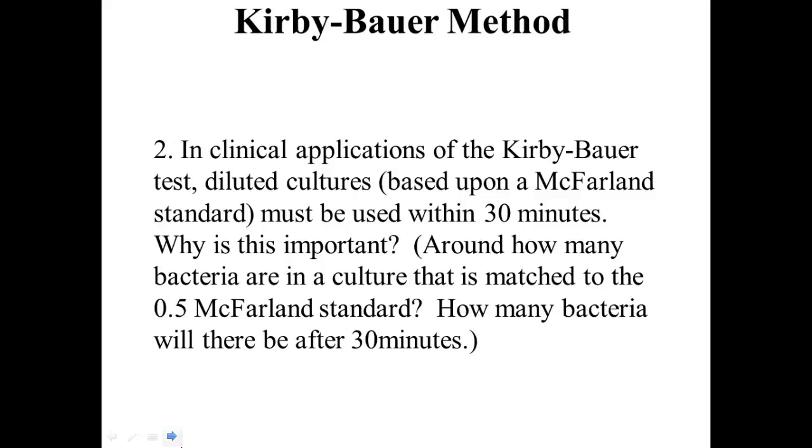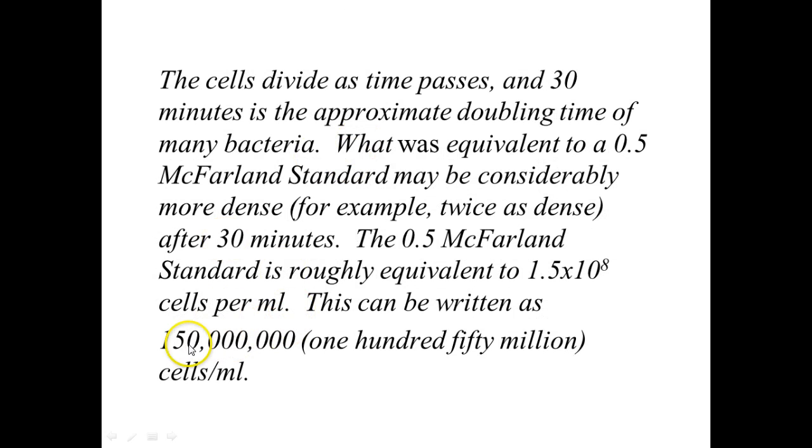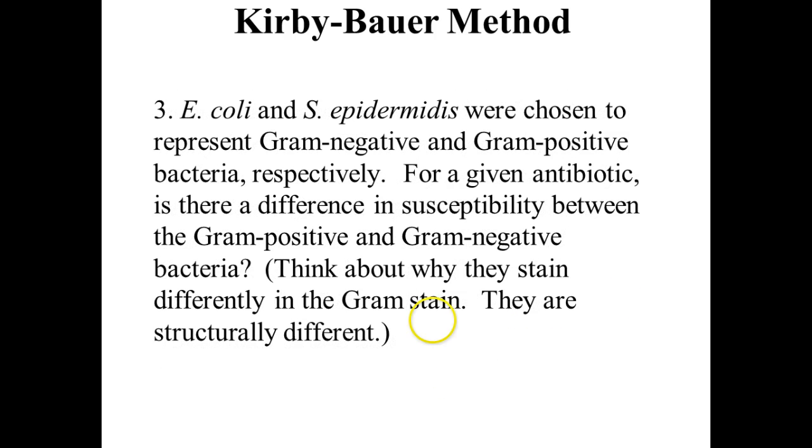That pre-made standard is supposed to be around 1.5 times 10 to the 8th, which would be 150 million cells per milliliter, right? And as Peter said, that's more cells than the population of China. So we're talking about a lot of cells, and it didn't even look that cloudy. It barely looked cloudy at all. For a 10 mil culture, 1.5 billion cells in a 10 mil culture. Oh yeah, if you had a 10 mil culture.